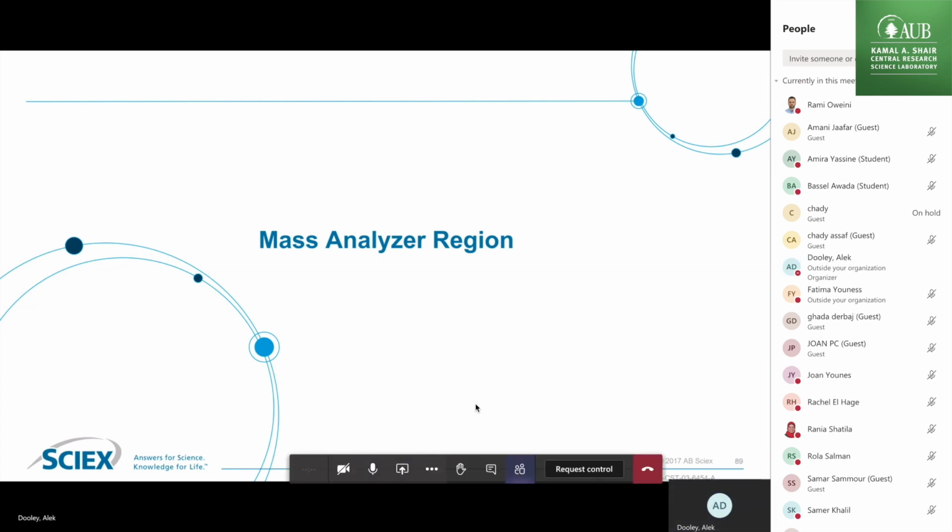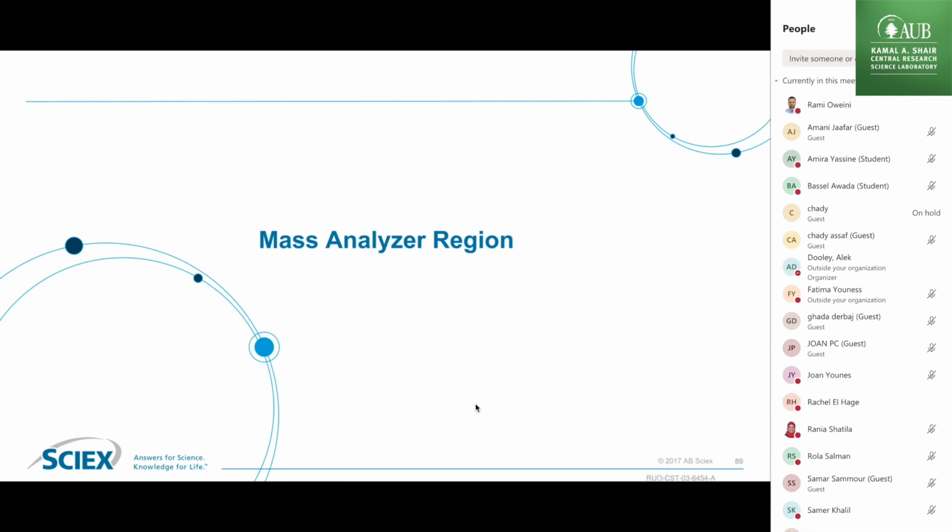Thank you, Alek. Actually, we have a question concerning the sample preparation for tomorrow. Okay. So we'll have the group from the research group of Dr. Saliba working first with their samples. So we'll have Rachel as well as Amira. They're here with us today. They can tell us a little bit about their samples, but we want to ask, when we spike the sample with the triazine, is there a specific concentration that we need to add?